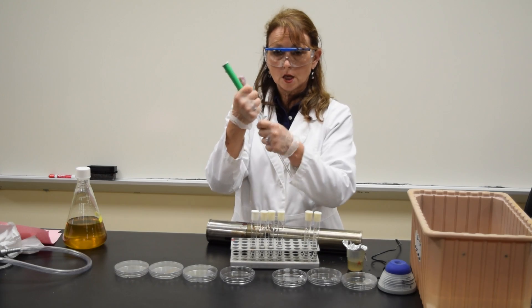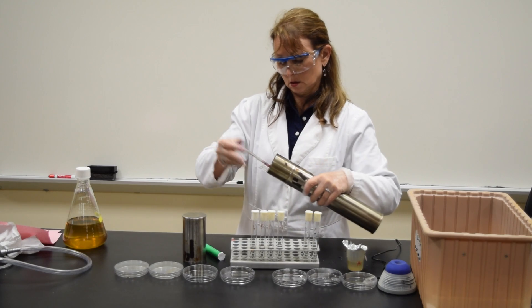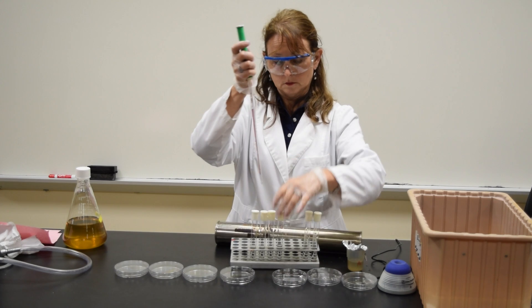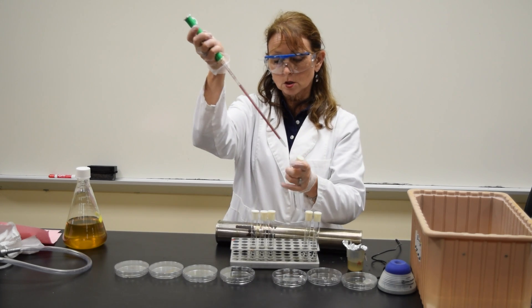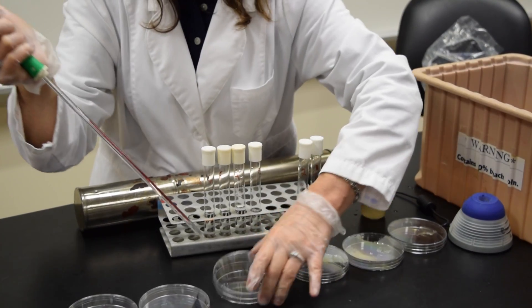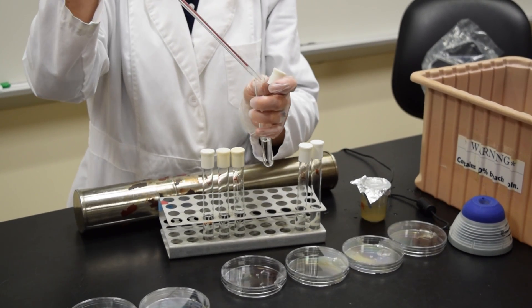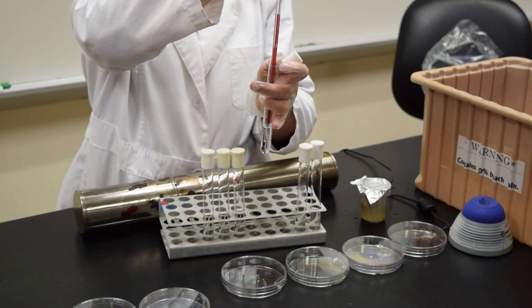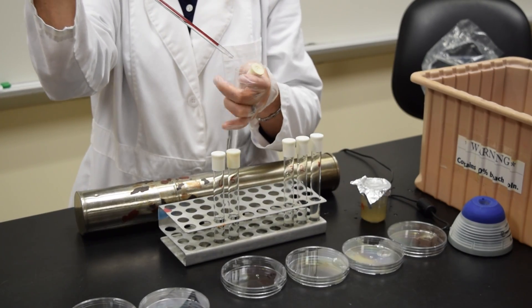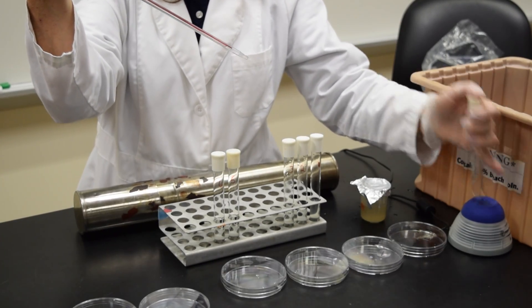Vortex the tube. Change the pipette. I use each pipette twice. From my 10 to the minus 3 tube, draw 1 ml and add it to the 10 to the minus 3 plate. Go into the tube a second time, draw to 1 ml, and add the 1 ml to the 10 to the minus 4 dilution. Vortex the tube.